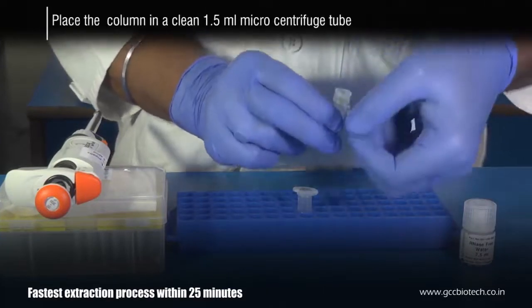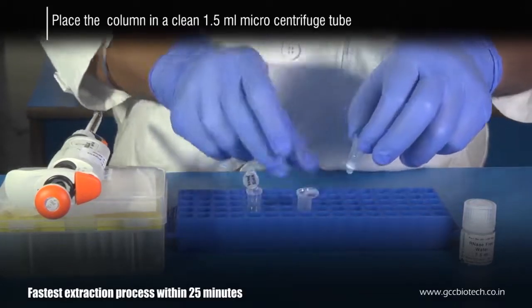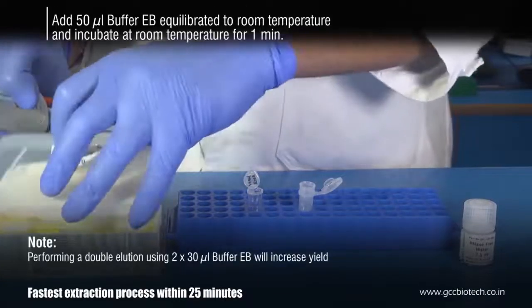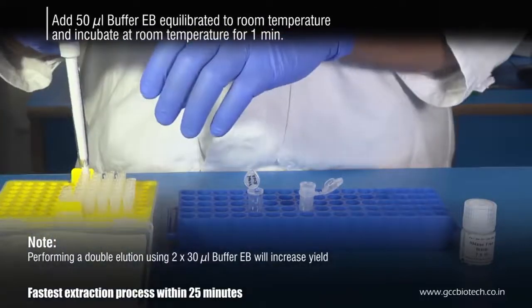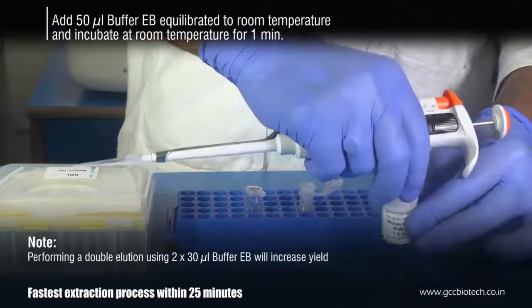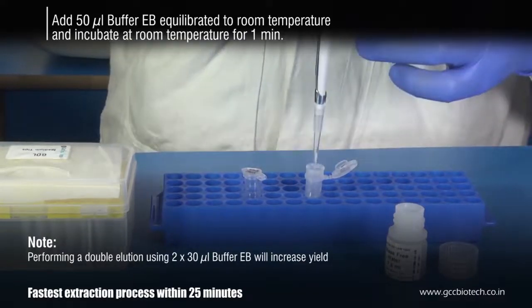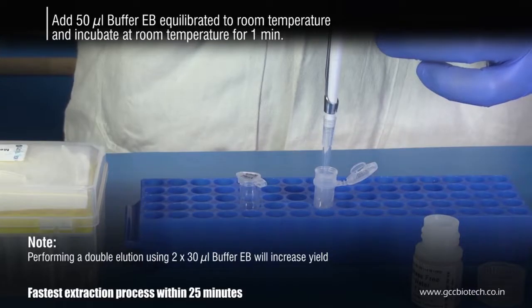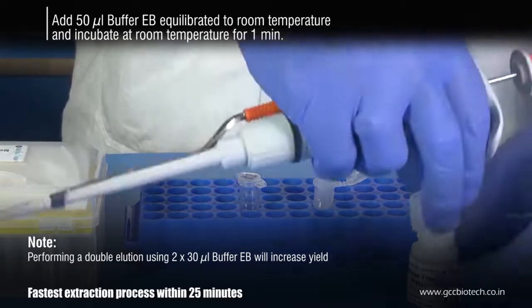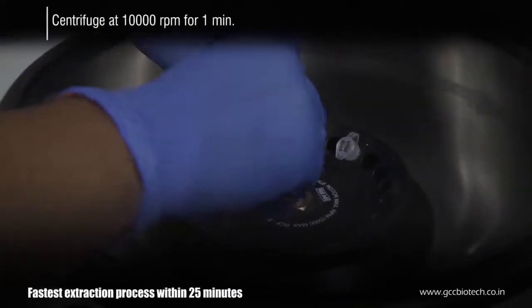Remove the column from the collection tube and place it in a fresh 1.5 ml microcentrifuge tube. Add 50 microliters of buffer EB and incubate at room temperature for 1 minute. Centrifuge at 10,000 rpm for 1 minute.